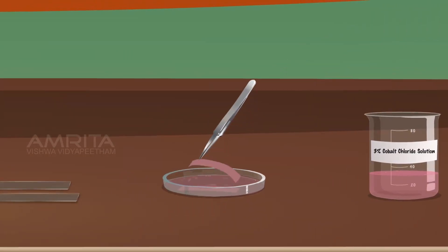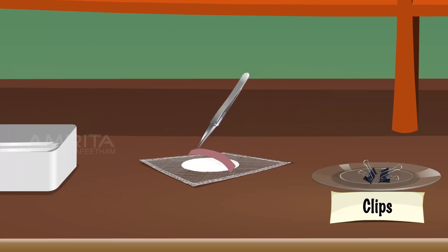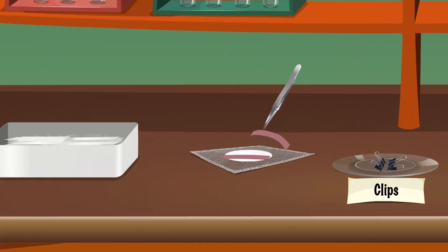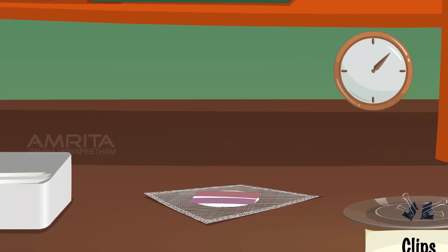Remove the strips from the solution using forceps. Place the strips on the wire gauze to allow them to dry. The filter paper then becomes blue in colour on drying.